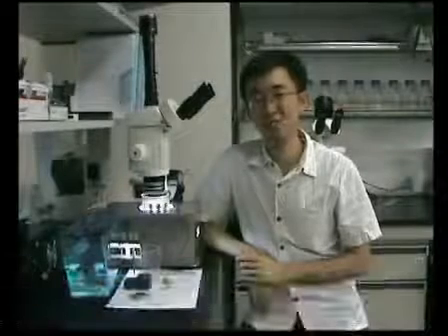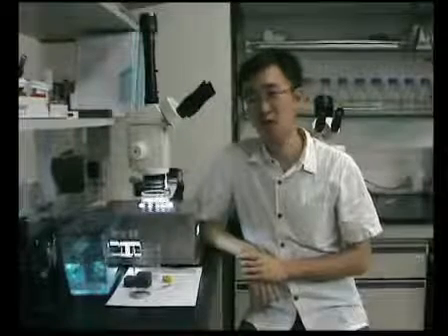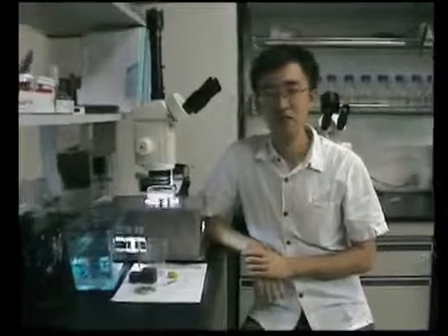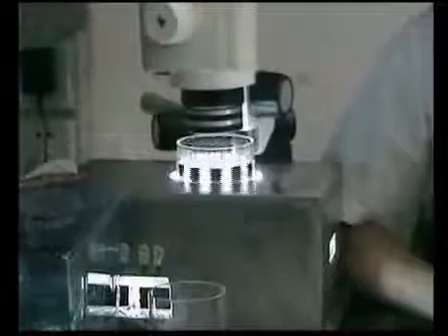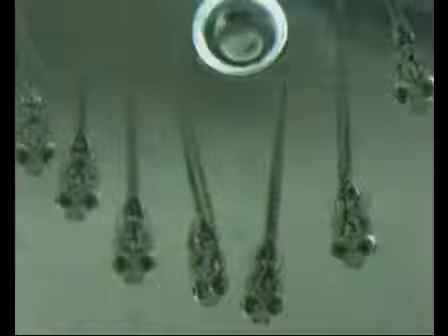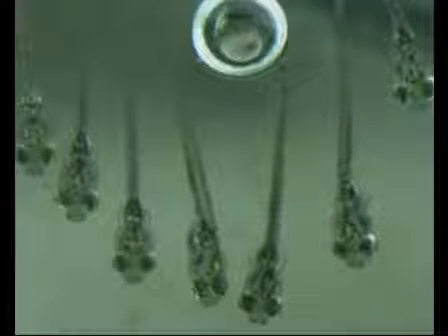Hi everyone, my name is Min Jin and I'm from USTC. As we know, the optokinetic response, or OKR for short, is a behavior test where an animal moves its eyes to follow a grating moving around it. This behavior has been widely used to assess the visual functions of larval zebrafish. However, the method used in the standard protocol to fix the larval fish is not readily applicable for adults.